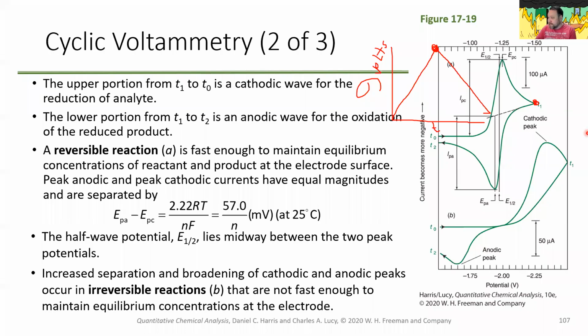Resume recording. All right, so we had left off with cyclic voltammetry. And cyclic voltammetry is probably the technique that you're going to see the most if you go into chemical research. So this is a very research-heavy technique. You do see it in some non-research applications, but if you're going to go work in a lab that's going to build a new material, or you want to look at electron transfer or something like that, you're probably going to be doing some cyclic voltammetry to characterize the material or compound that you make.